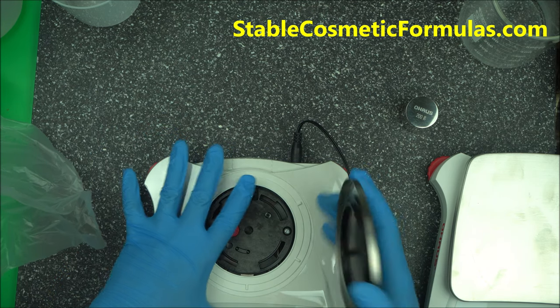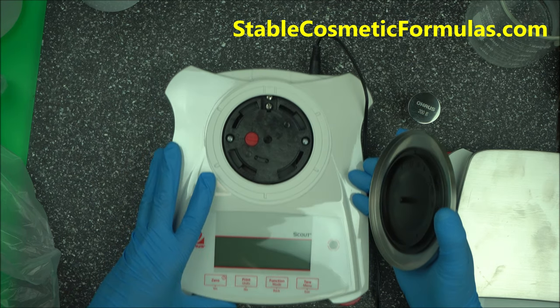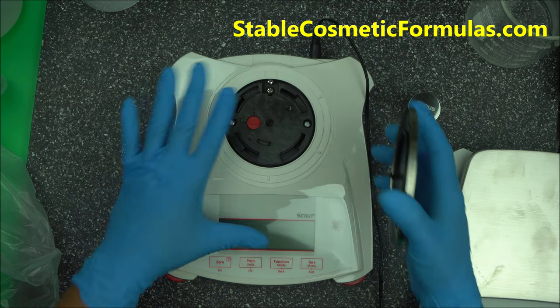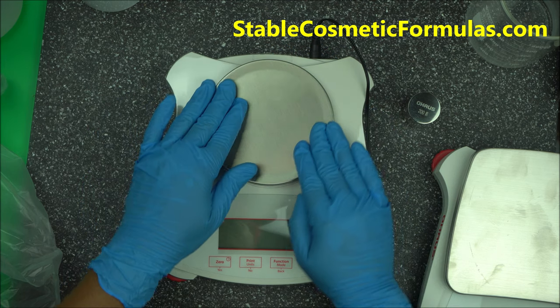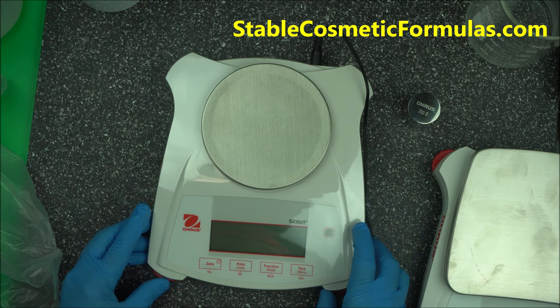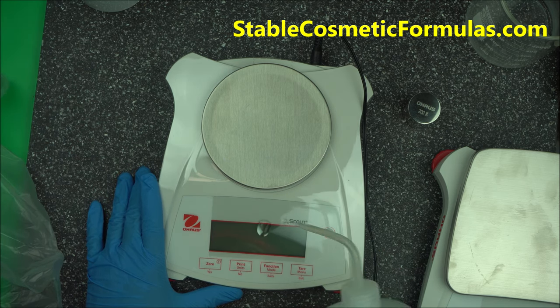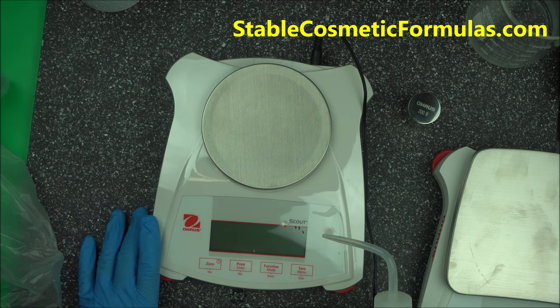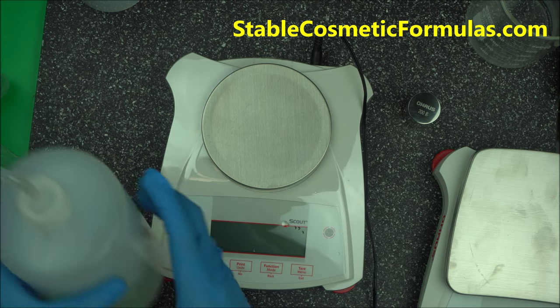If your version isn't fitting easily, open the cover first and let the pan section go down first, then set it down and cover it. You can see how water runs off the cover — that's how it protects your scale from spills.